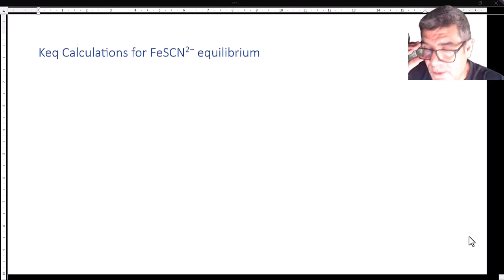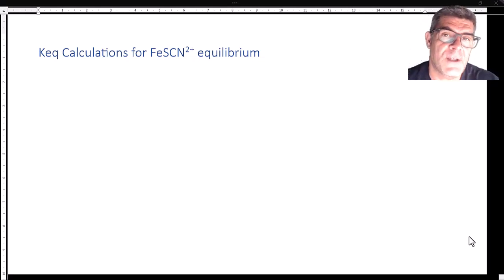So before we do the final calculations, there's probably a couple of things that we need to recognize. Firstly, the errors associated with the collection of values and then the construction of the calibration curve are significant. And you can see that from the fact that if I use the line of best fit that passes through all my data points, I calculate a value of concentration which is almost twice what I would get if I bring that line back to the origin.